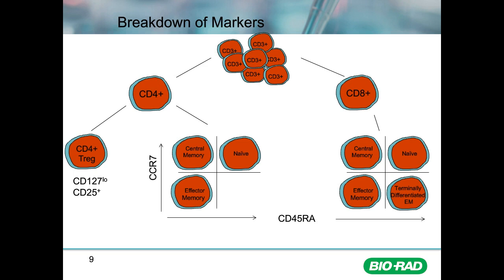Over the course of T cell stimulation, the T cells became increasingly differentiated, and underwent progressive loss of key surface molecules. Naive cells lost CD45RA first, and then CCR7, eventually losing CD28 and CD27 expression. The exception to this loss of CD28 and CD27 was the terminally differentiated effector memory CD8 T cells. With continued stimulation, expression of the inhibitory checkpoint markers increased and cytokine production decreased.